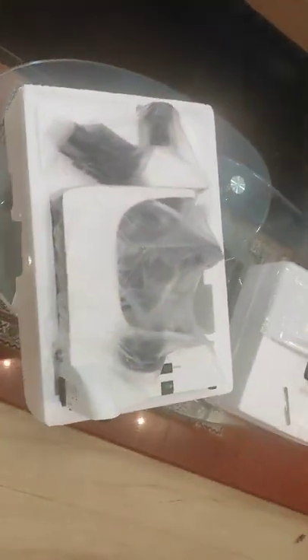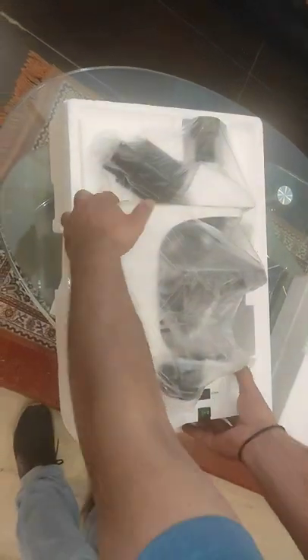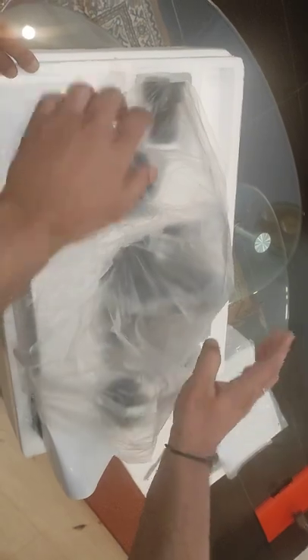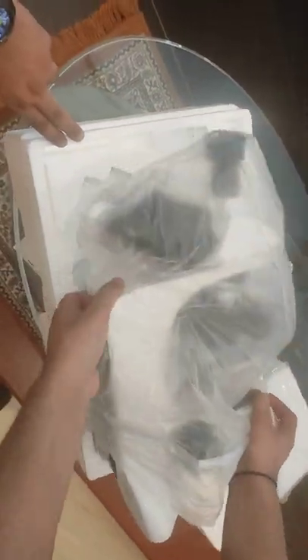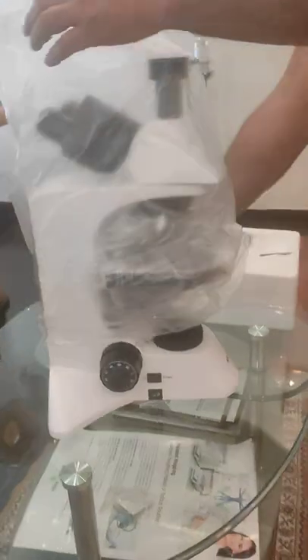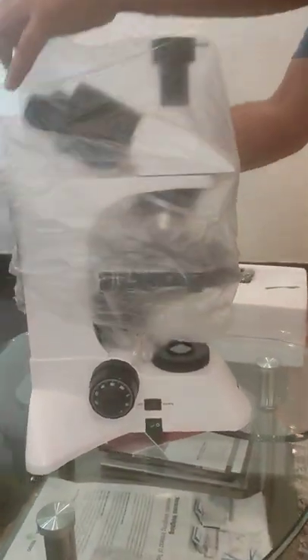Now we will take out the microscope from the box.